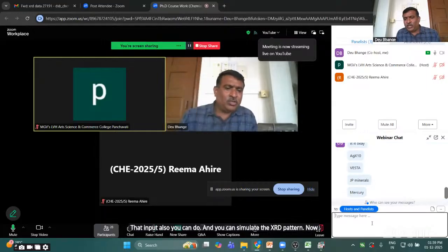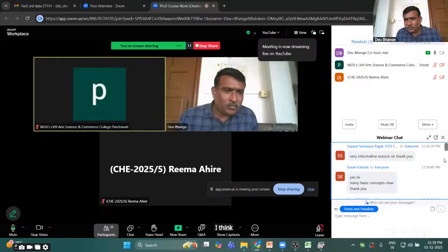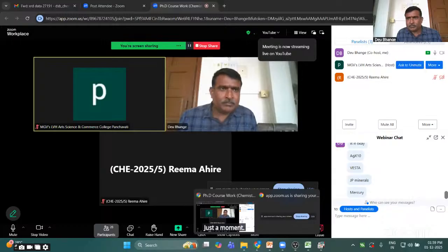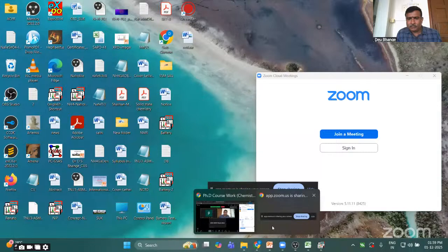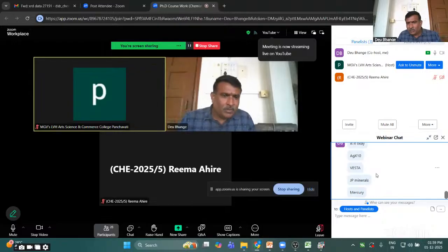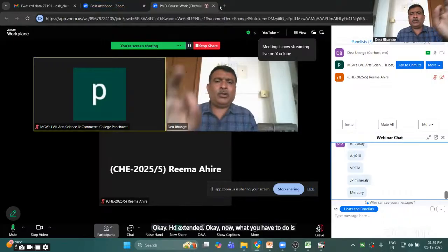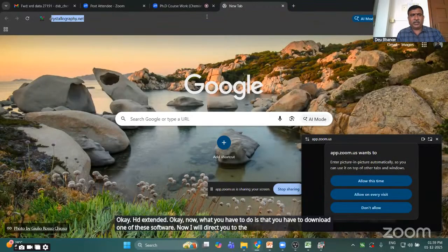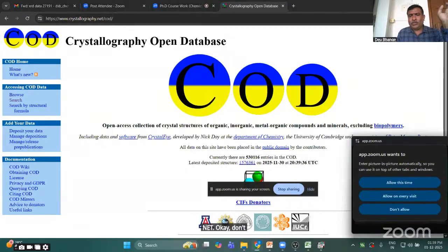Now I will just simulate. I think there is some problem with this one. Just a moment. Okay, now what you have to do is download one of these softwares. Now I will direct you to the website crystallography.net.